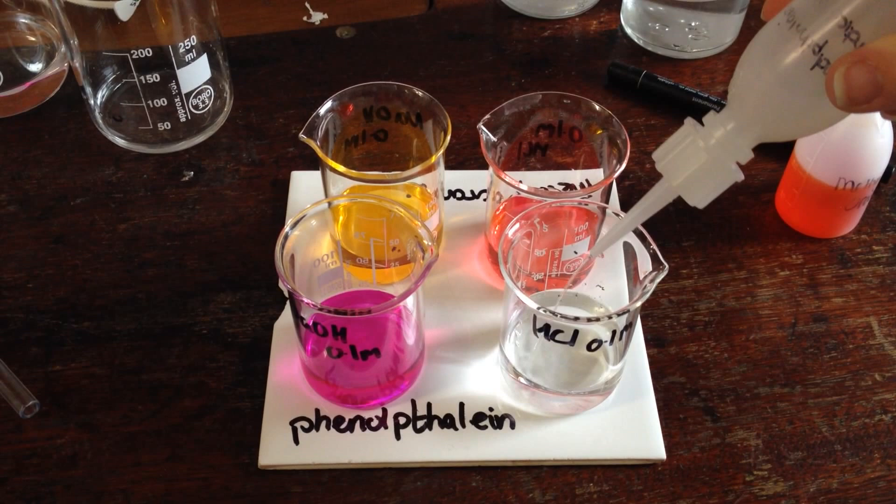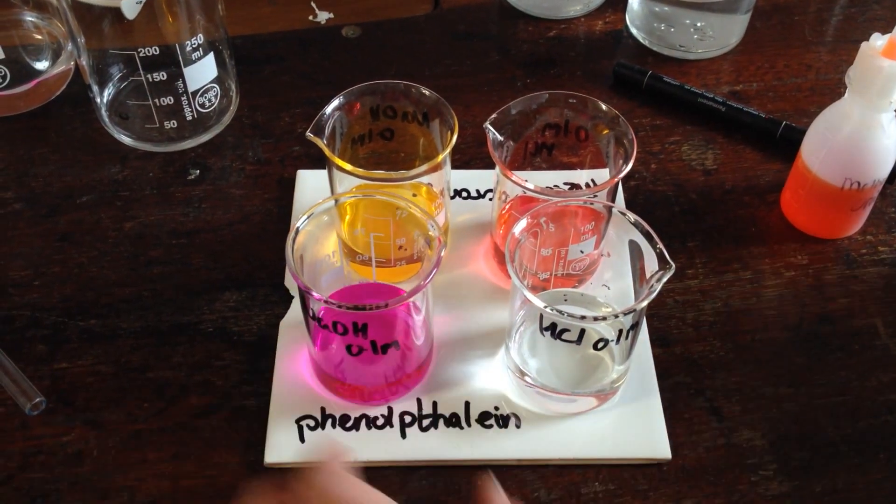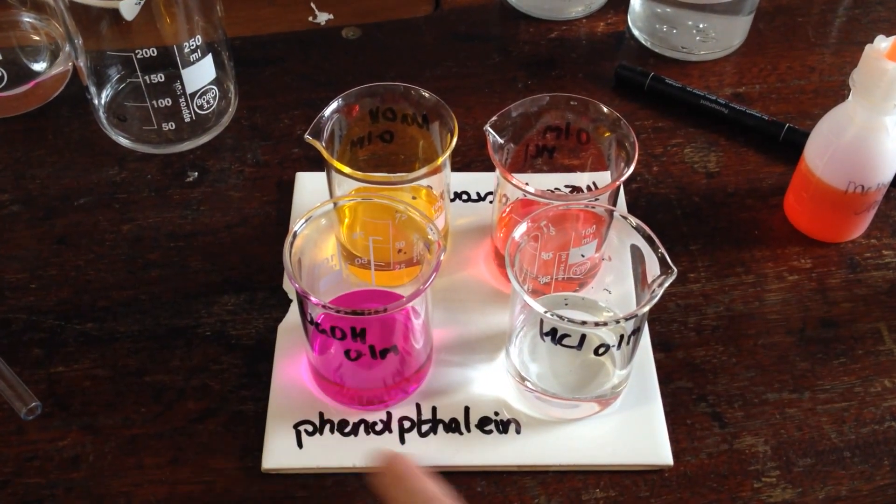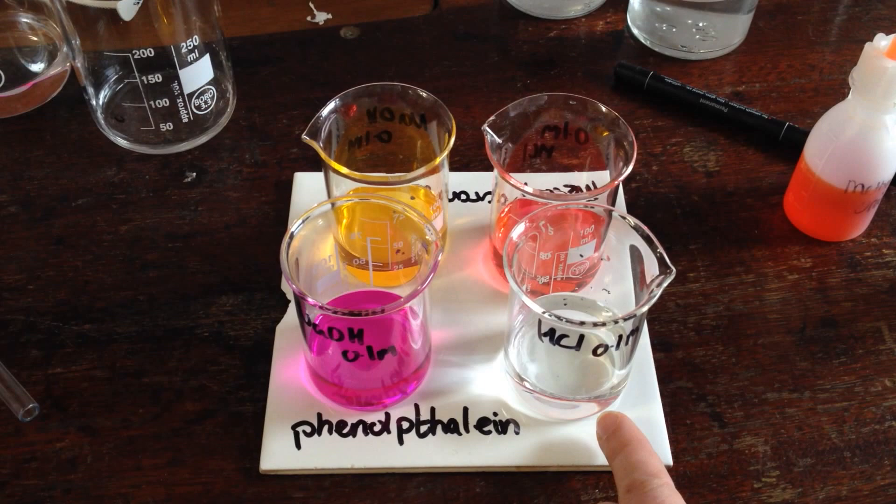Add in a few drops. We can see that phenolphthalein in alkaline is pink and in acid is clear.